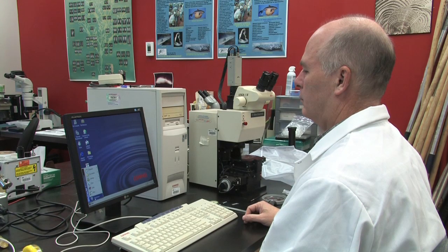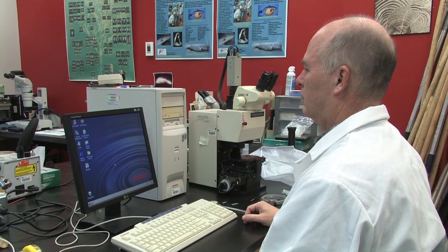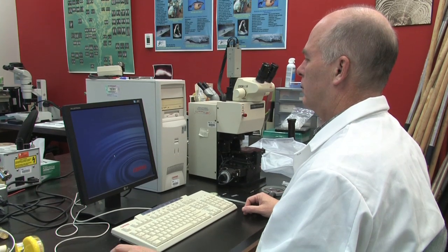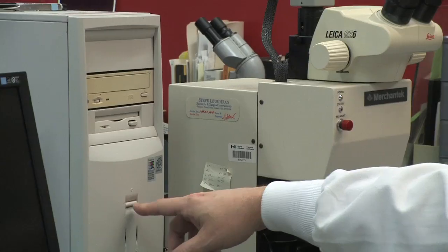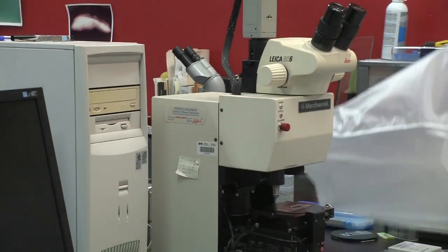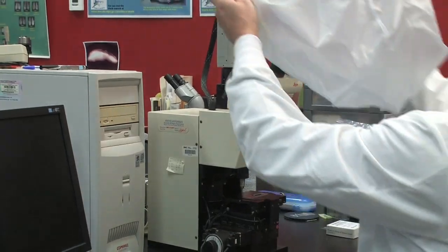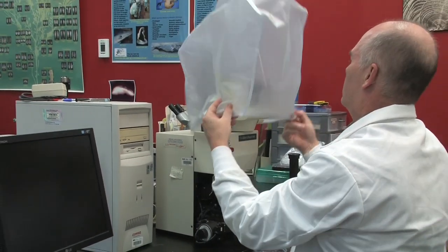When shutting down the system, the computer screen and micromill will have to be turned off manually. The computer will not shut down by itself. Make sure everything is turned off and cover the micromill.